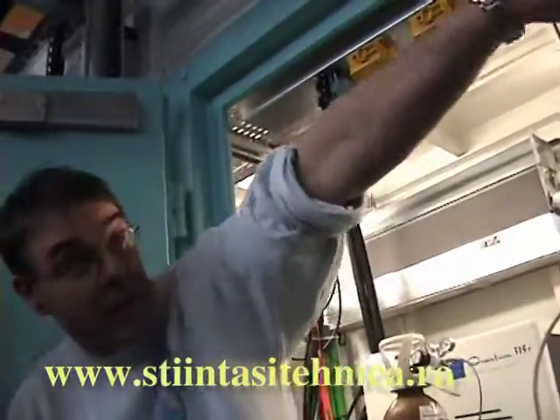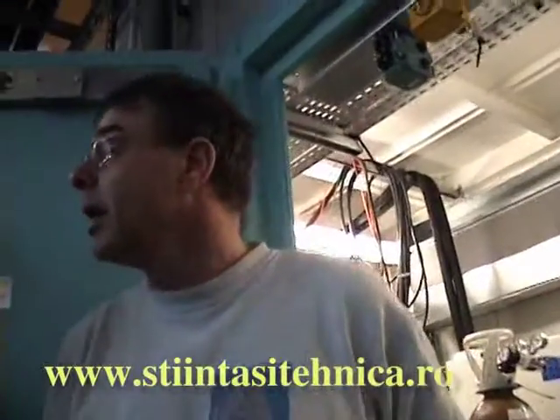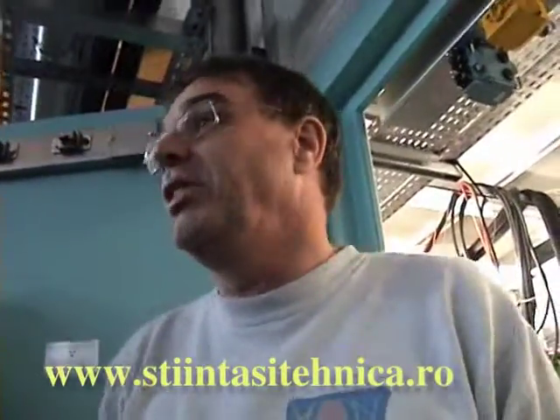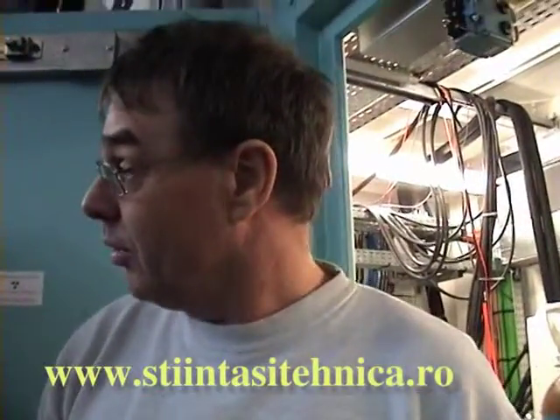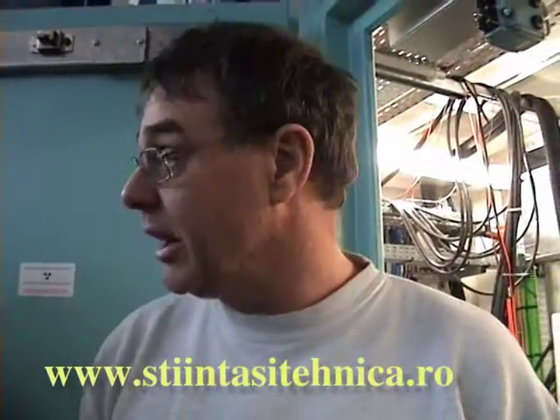The beam comes from behind there. Radiance beamline. A beamline, yeah. So basically it's just a big vacuum tube that brings the radiation from the synchrotron source and then adapts that radiation to the type of experiment that you want to do.